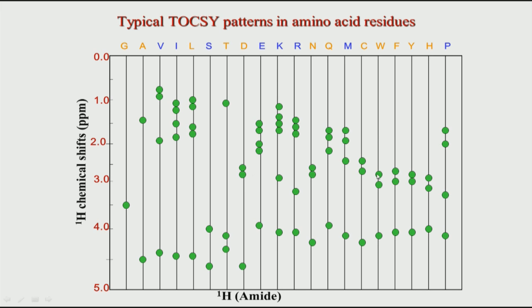We can see that later in the course. And then amino acids like glutamic acid, lysine, arginine, isoleucine and so on have beta, gamma and delta protons as well, and therefore we use the words long side chains. But as far as our interpretation of NMR data is concerned, we will not worry about these nomenclatures; we will simply use the names directly.